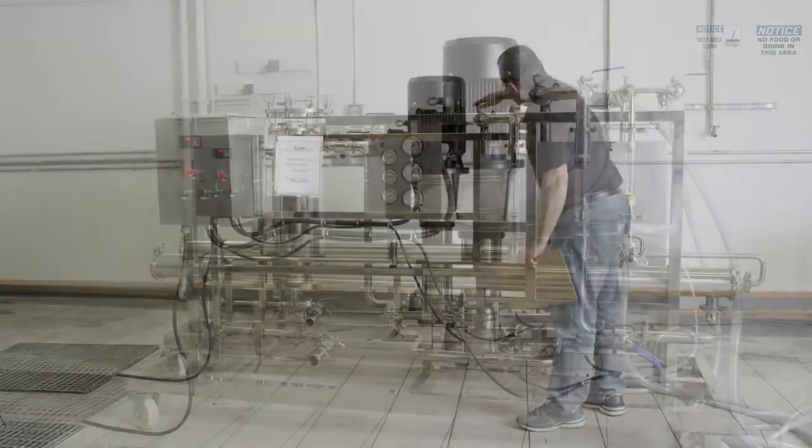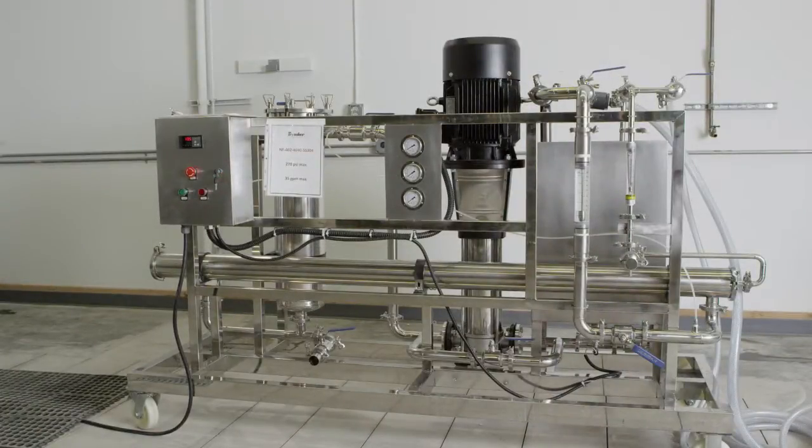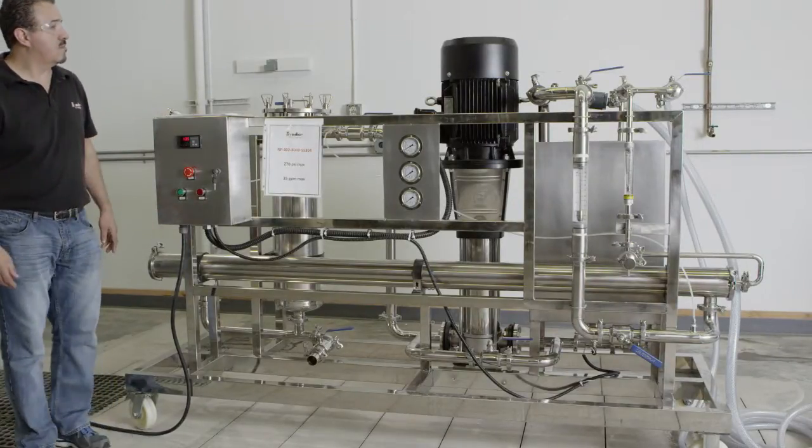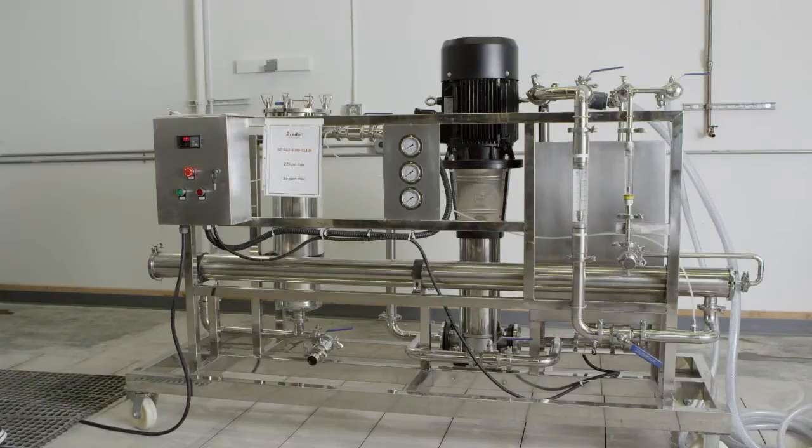Once all alarm conditions have been addressed, the final step in system startup is to continue running the system for 30 to 60 minutes in order to flush the preservatives from the membranes. You are now ready to run the process fluid on your membrane system.